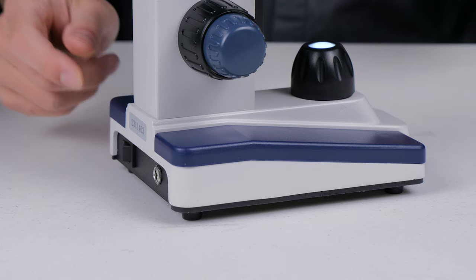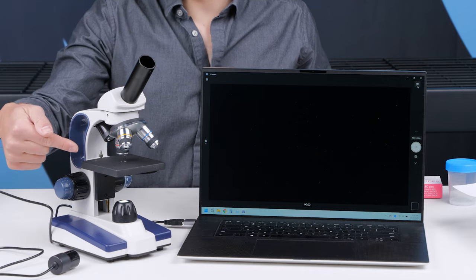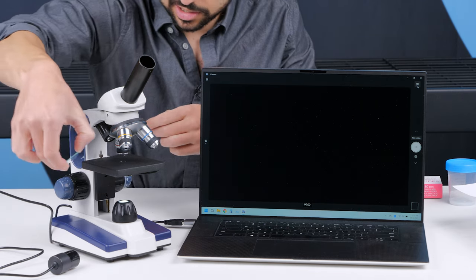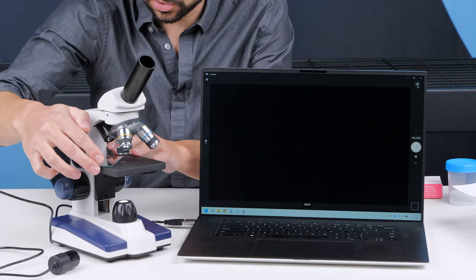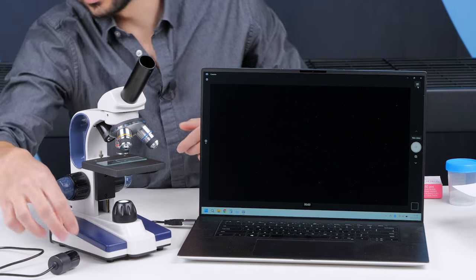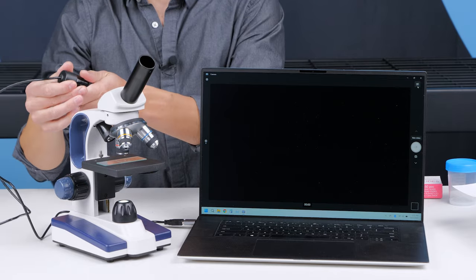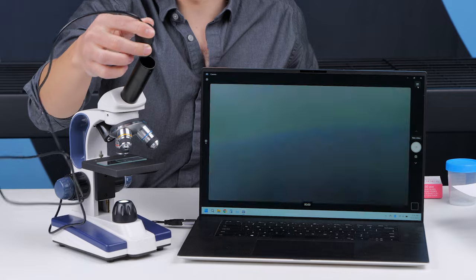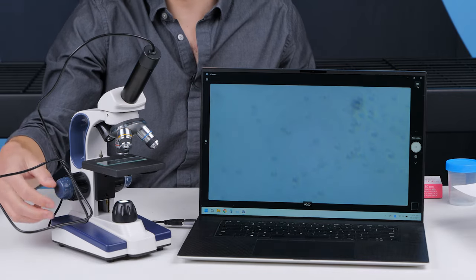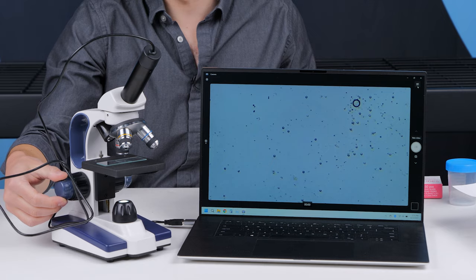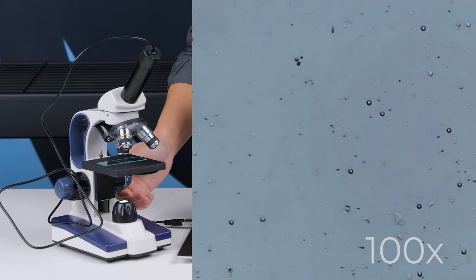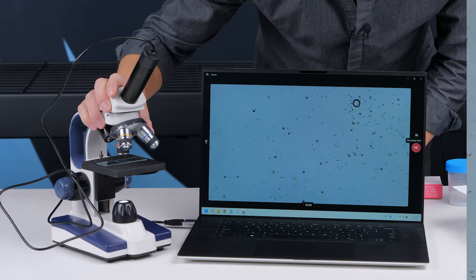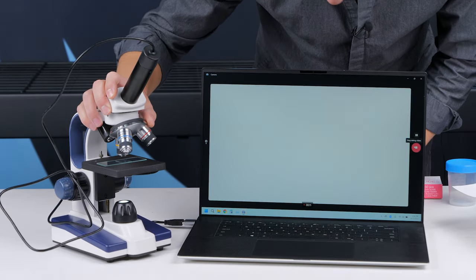Turn on the transmitted light source of your microscope. We're going to start on the lowest magnification objective. You can take that microscope slide you just prepared and put it right over in the middle of the light source. Boom, just like that. In this case, we are using the MicroSafari Sperm Observation Kit, which comes with a USB camera. This is actually a pretty critical part of this kit because it has really good edge detection. And at this magnification, you can barely see little sperm swimming around in there. That's why we want to go up to the next magnification up.